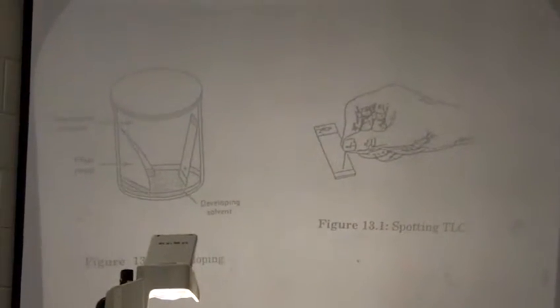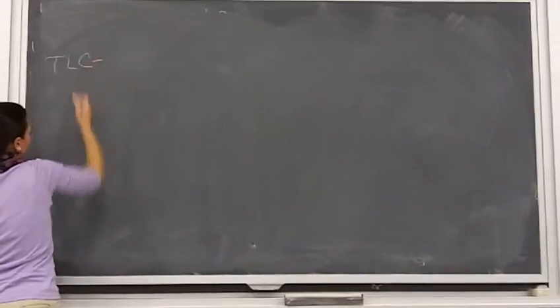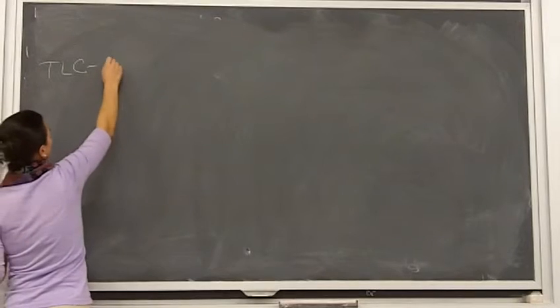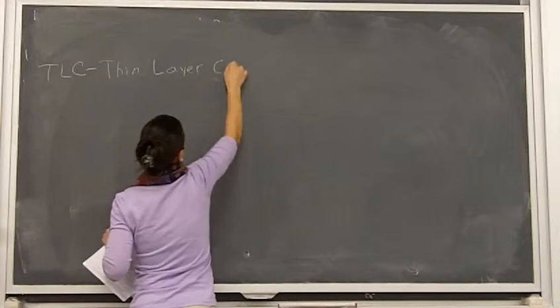So here is what is involved with TLC, and we'll talk about what TLC is here, and then what all we need to do. Okay, so TLC, very useful tool in organic chemistry, used all the time for monitoring reactions. It stands for thin layer chromatography.